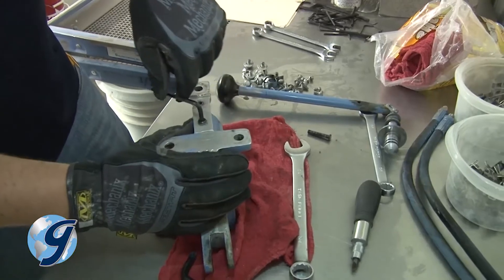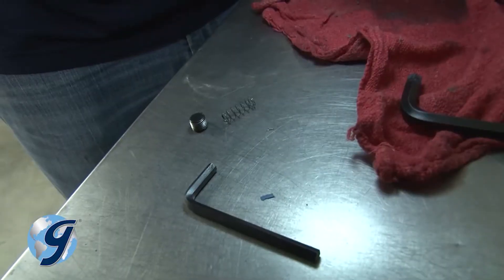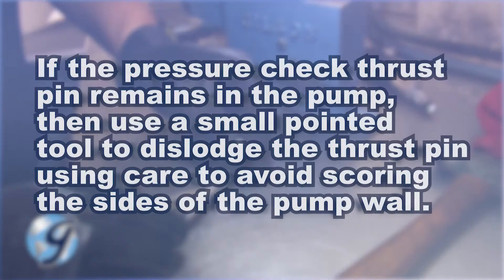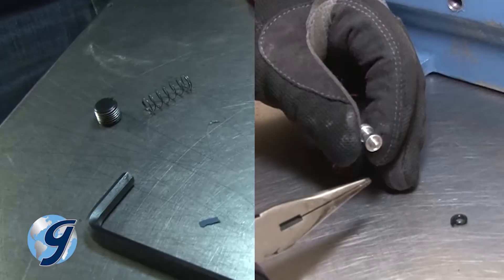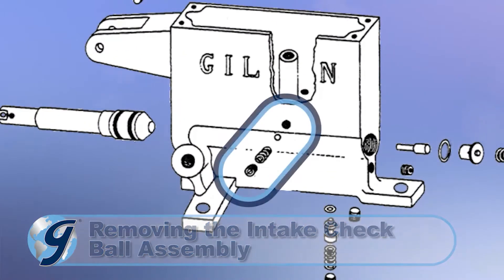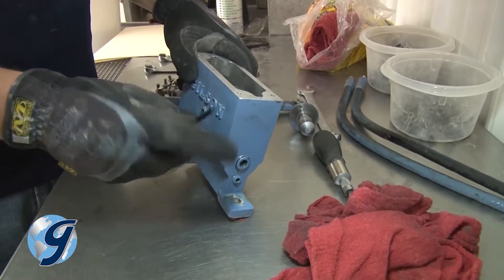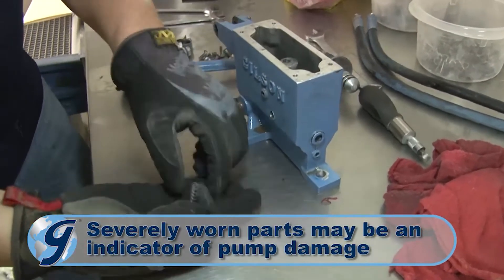Next, remove the pressure check plug on the underside of the pump, closest to the pump handle. Removing it will also yield the pressure check spring and pressure check thrust pin with an O-ring. If the pressure check thrust pin remains in the pump, carefully work the pin out using a small pointed tool, taking care to avoid scoring the sides of the pump wall. Inspect all items removed and set them aside. Next, remove the intake plug located on the side of the pump and away from the pump handle, as well as the intake spring and check ball. Inspect for wear and set aside.